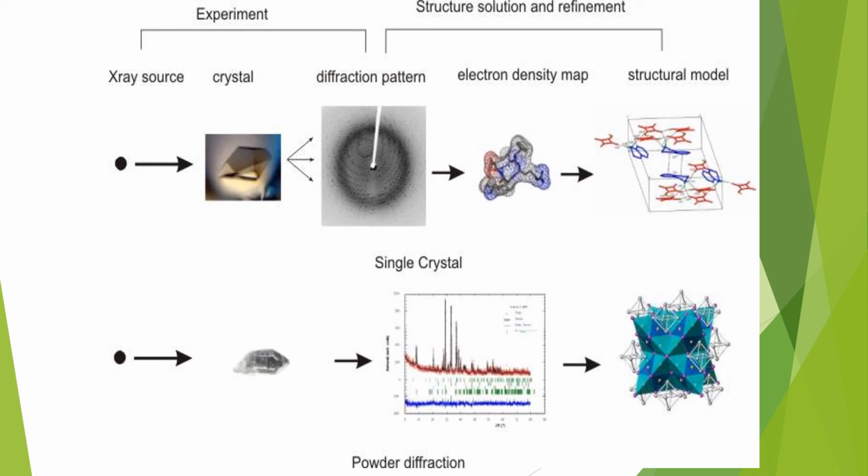And the other method that is used for the structure determination is powder diffraction.